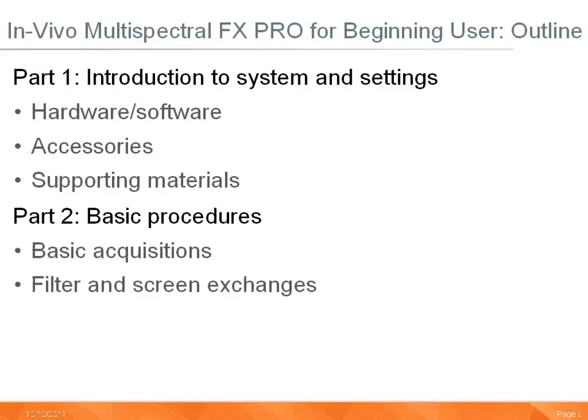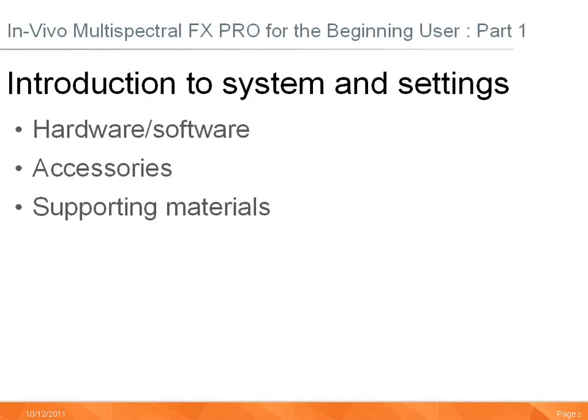Today's session is divided into two parts. Part one is an introduction to the system and settings as well as supporting materials. Part two is a quick video session providing an introduction to some basic procedures that the general user will want to be familiar with. These procedures are basic acquisitions, emission filter, and phosphor screen exchanges. Part one, hardware, software, accessories, and supporting materials.